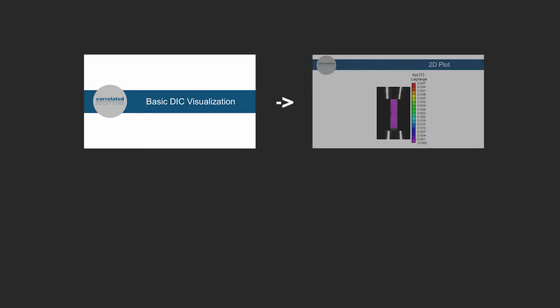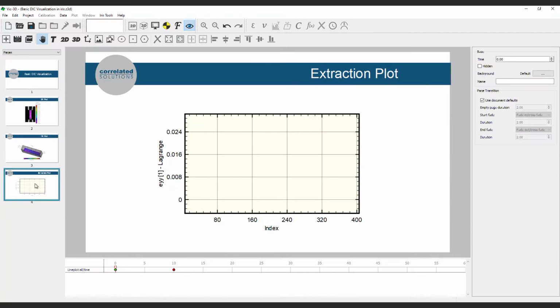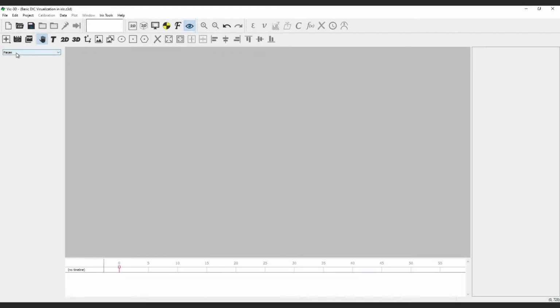Multiple pages enable elements like plots and images to come and go from a video and create standalone PDF pages. Use the pull-down at the top to select pages, templates, or backgrounds. Backgrounds and templates can be used to give a consistent appearance to videos through headers, logos, background graphics, etc. We will cover manipulation of backgrounds and templates in a separate tutorial. For now, we'll keep it very simple and start by adding an image, a few shape objects, and some text to a blank Iris page.